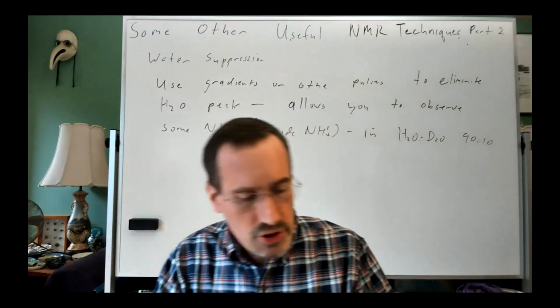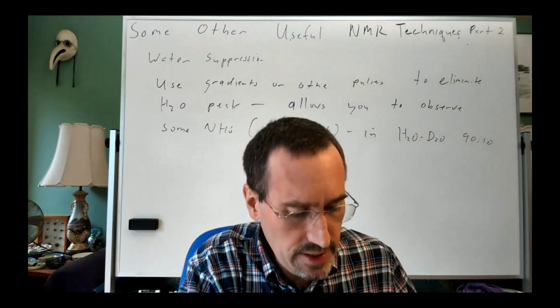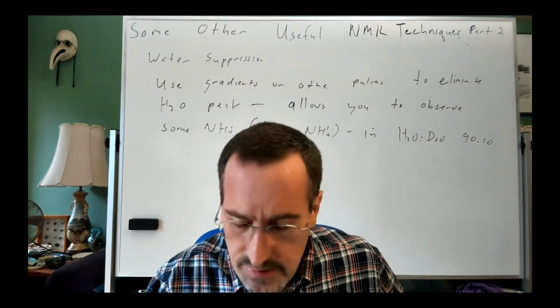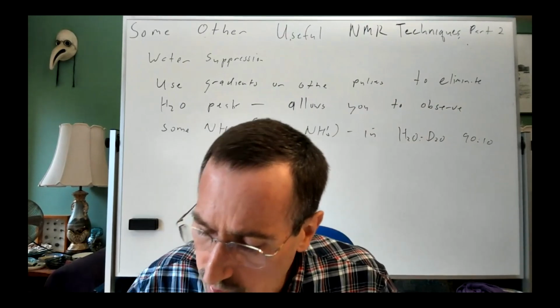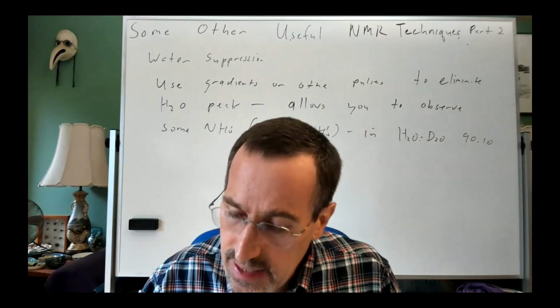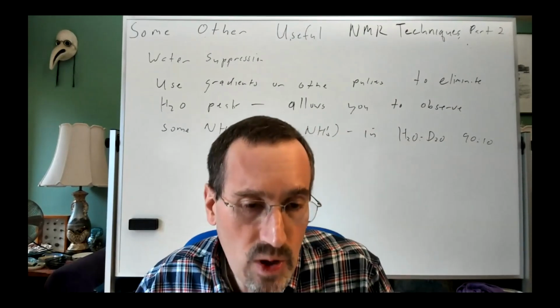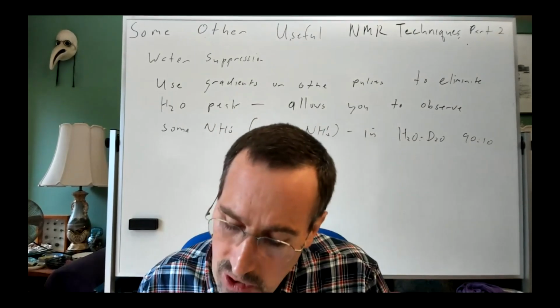And I want to show you a couple of handouts on this just so you can see what the technique entails. And I think probably the most useful handout for starters is going to be a couple of pages back in handout number 1, where they talk about one of the water suppression techniques in the pulse sequence.